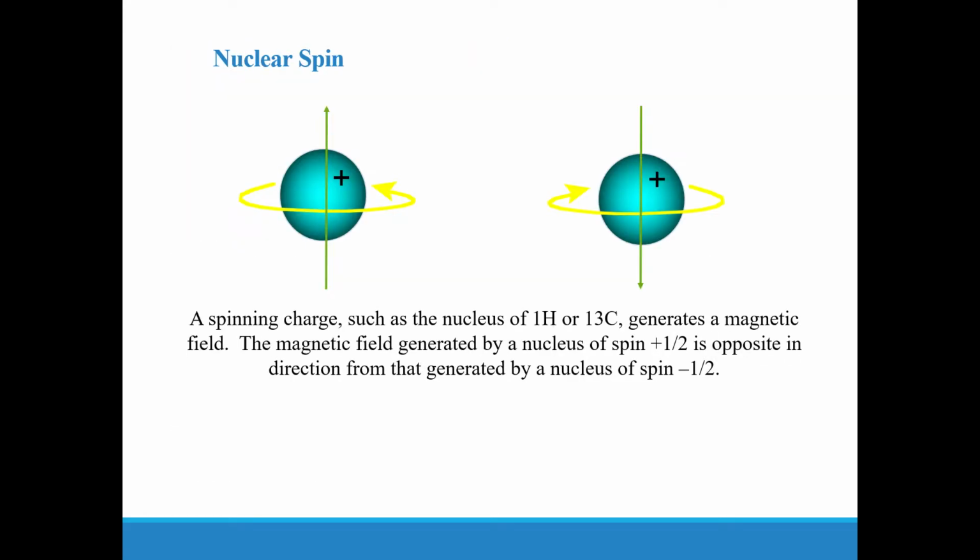Remember that all nuclei have some kind of spin state, whether it is positive or negative 1/2. Due to these spin states, they actually generate a magnetic field.